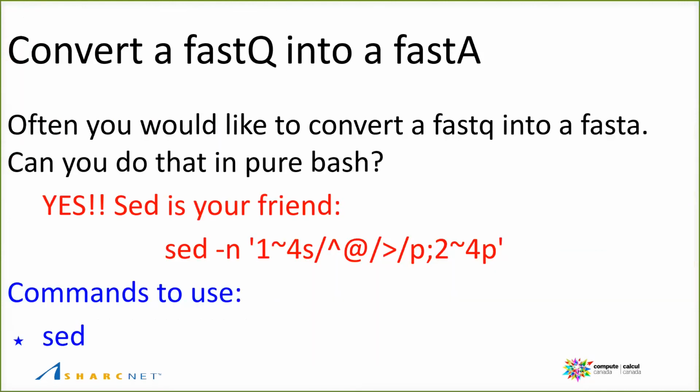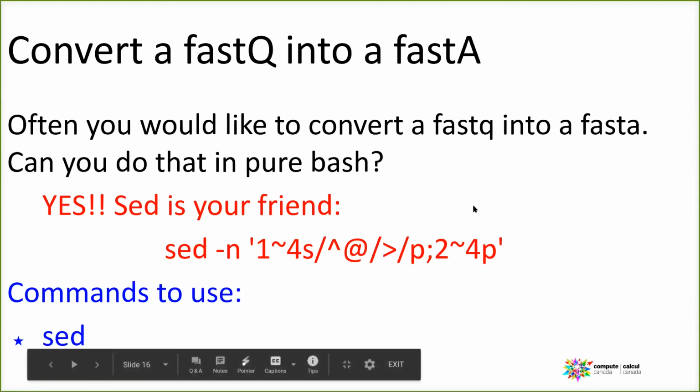All right. Now another more or less often task that you would like to do is to convert a Fastq into a Fasta. Okay. Can you do that in pure Bash? Yes. And sed is going to be your friend right now. And this seems odd, but I'm going to explain it little by little.